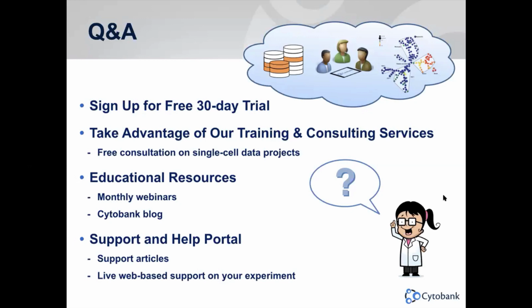Well, I'm not exactly sure how it's implemented in Cytobank. So I know that technically you can go, I think, very low. Practically, you come to the question, if your cluster has only like 5 cells, is it something meaningful that you're looking at, or completely not? I think the cutoff is 50 cells per cluster in the implementation of Citrus that I used last time. And that's kind of what we ended up with when we looked at the iNKT cells. That's probably the cutoff that we set, because those cells are very rare.